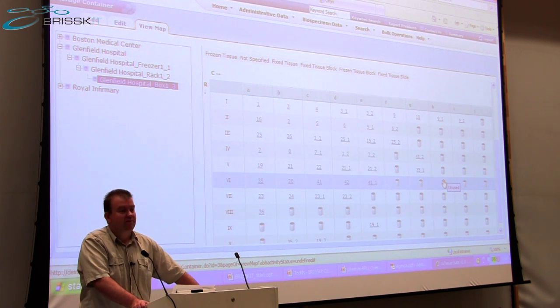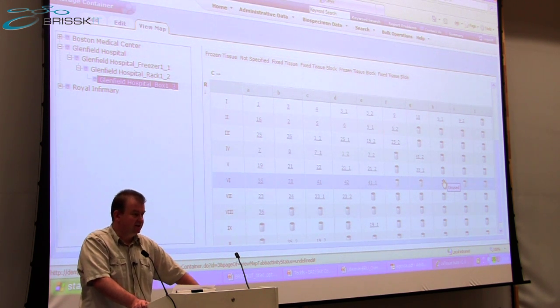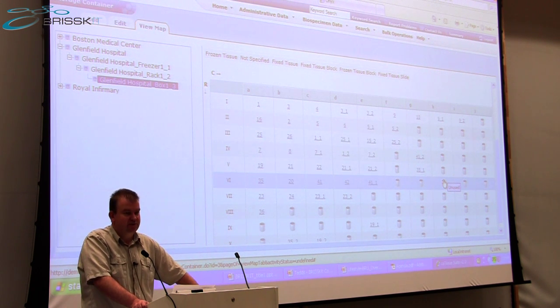So by tomorrow, a search running in I2B2 would show not only this participant's questionnaire data, but it would also show details of the blood samples that have been stored in CA Tissue, modelling those samples stored in the freezers and fridges within your lab.